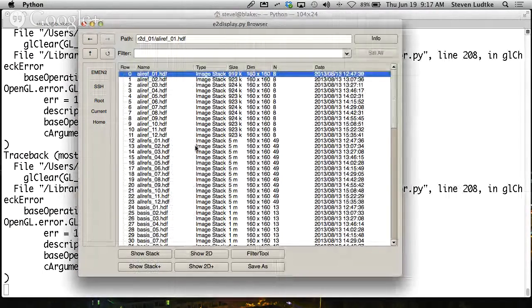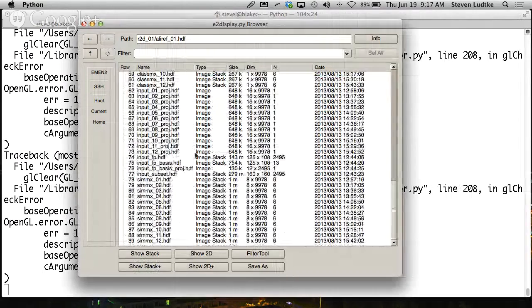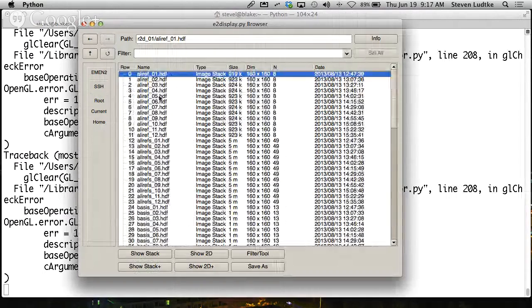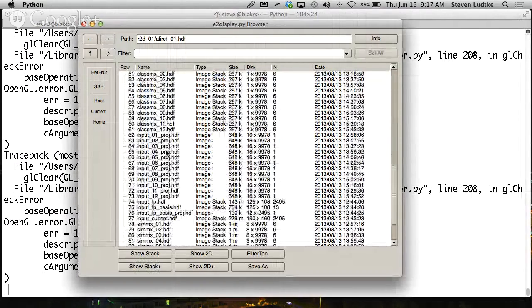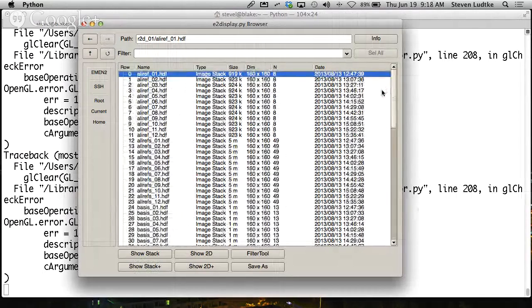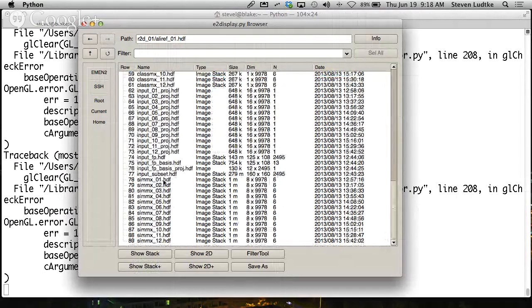So those alignment references will then be used to align the particles for the next round in the iterative process. Okay, so we've got a lie-ref, and we'll then take the particle input, the input stack that was provided, and we will align each particle to each one of these alignment reference images. That will produce the first similarity matrix file.